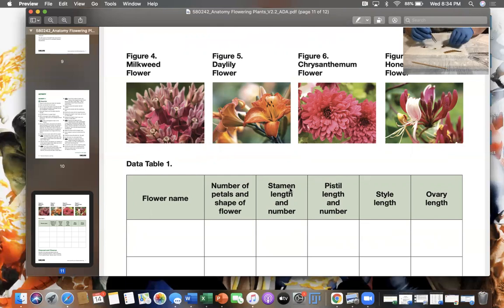But we can do our best. A technique you can use if you're trying to separate the petals is to push your forceps in between and then let them open to pull them apart, rather than trying to grab and pull, so you don't risk breaking them.